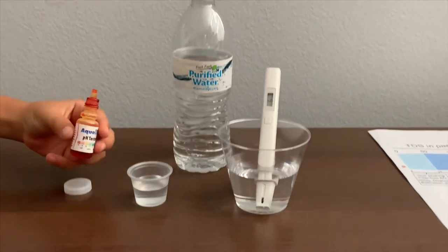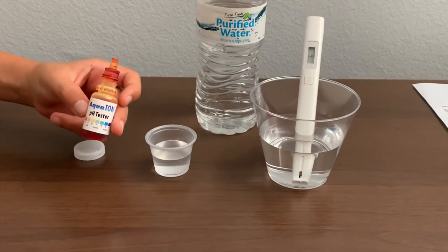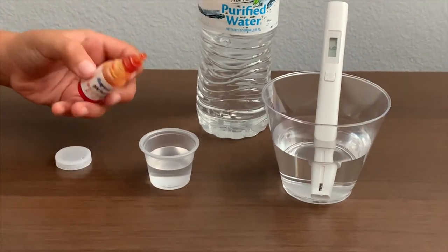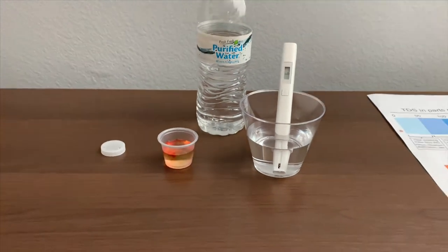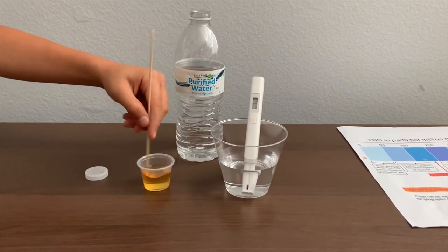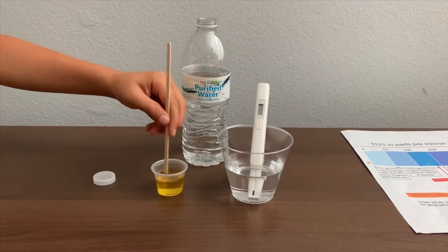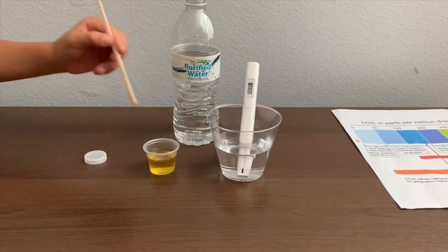Now let's test the pH level. If you want to buy this pH tester, check the link down below. Only do two drops. Let's stir it a little for a better result. I give this a 6.5. This is acidic.